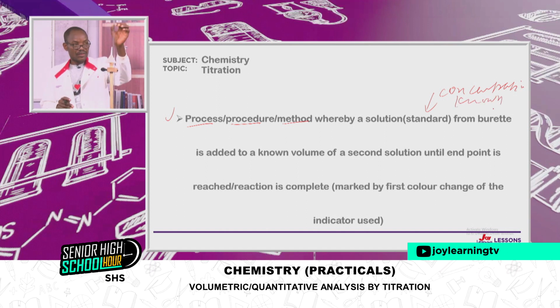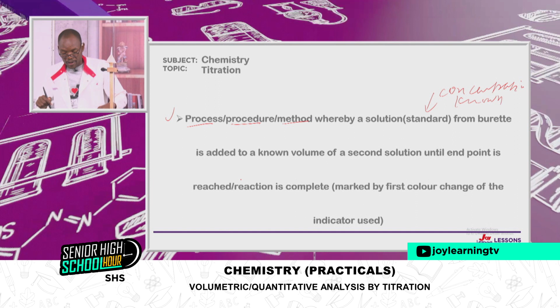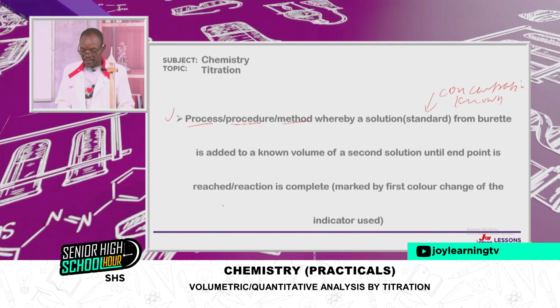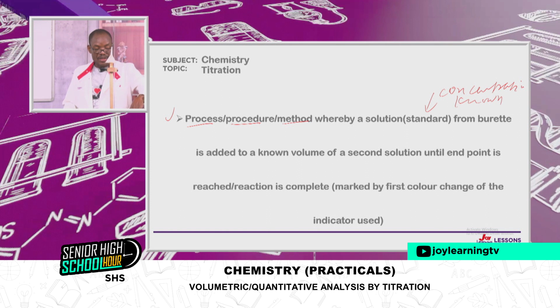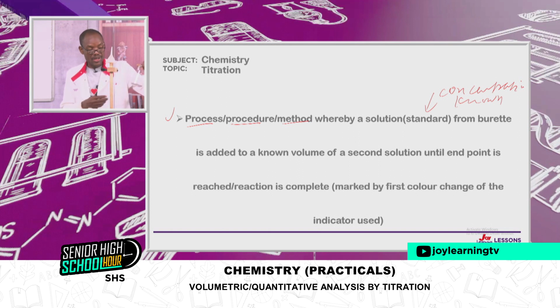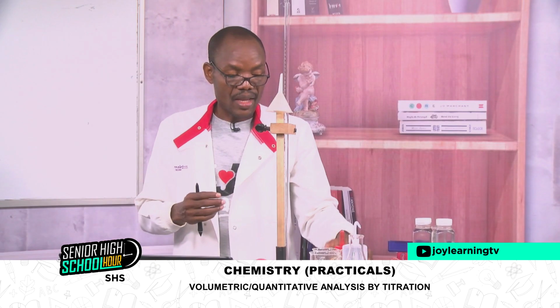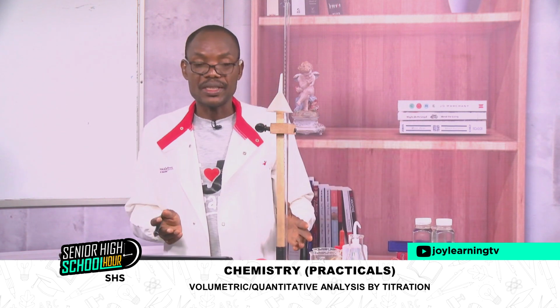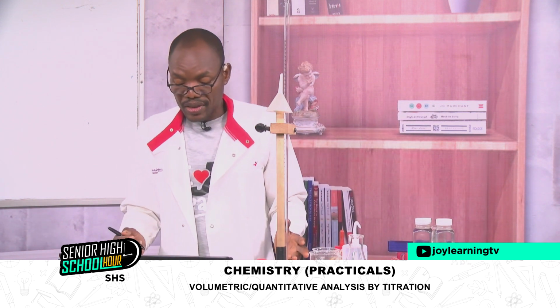From a burette, we have seen the solution is added to a known volume of a second solution until the endpoint is reached or the reaction is complete. How do I know? I'm putting an acid and a base together. For example, I put the acid in the burette, then the base in the conical flask. The indicator will change color. That tells us that the reaction between the two solutions, that is the acid and the base, is complete. And then we stop the titration and do all our recordings.